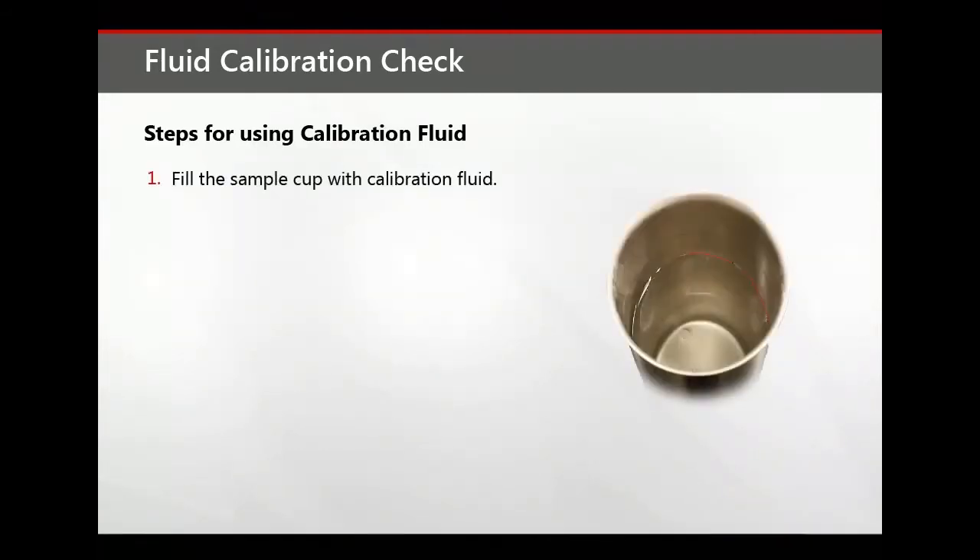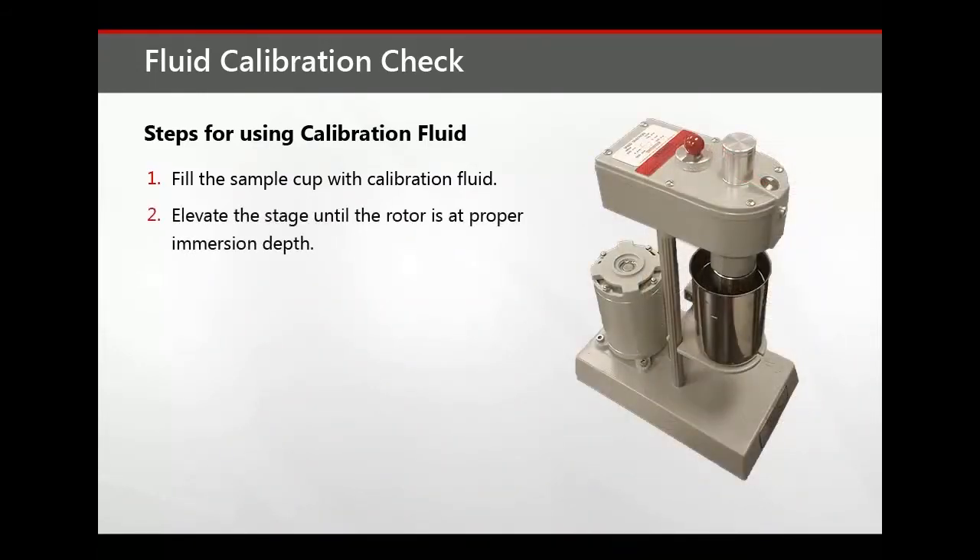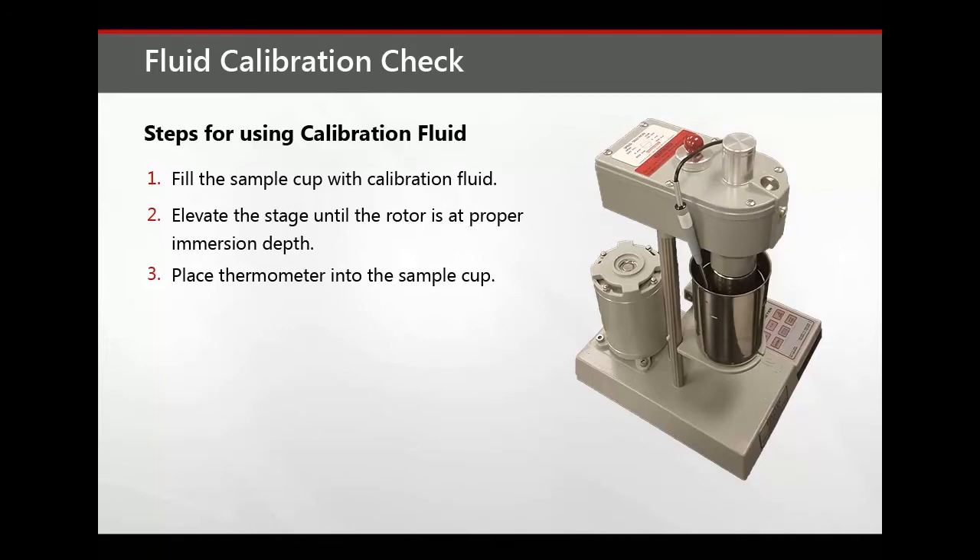First, fill the sample cup to the scribed line with the calibration fluid and place it on the instrument stage. Then elevate the stage so that the rotor is immersed to the proper immersion depth, as noted by the scribed line. Place a thermometer into the sample cup until it touches the bottom and then secure it to the side of the viscometer to prevent breakage.